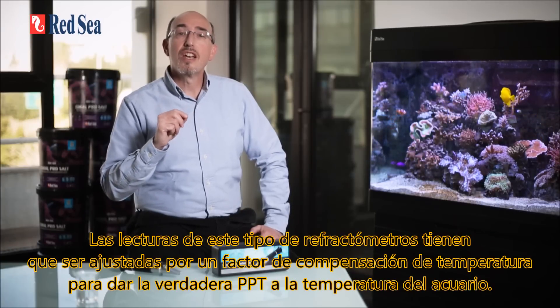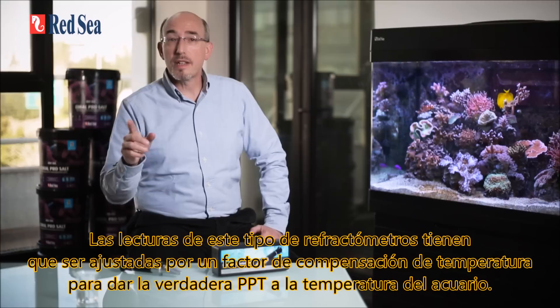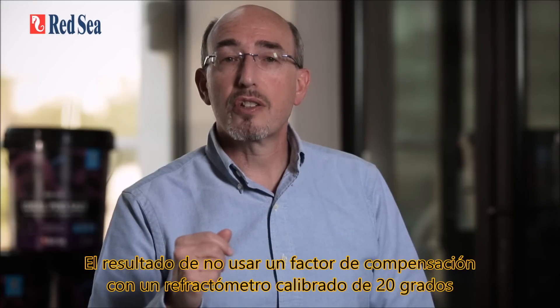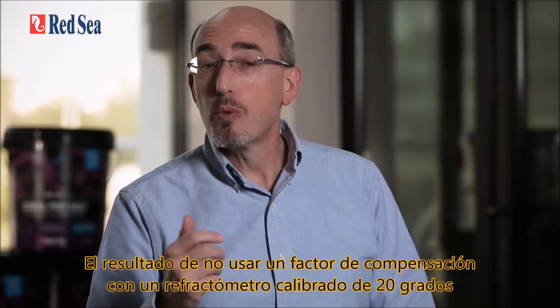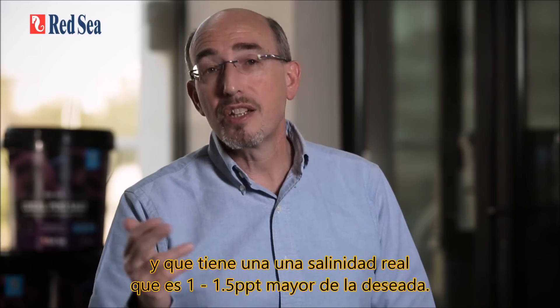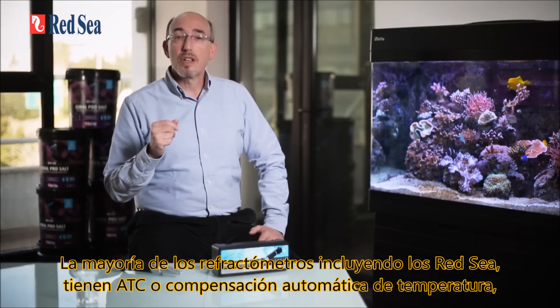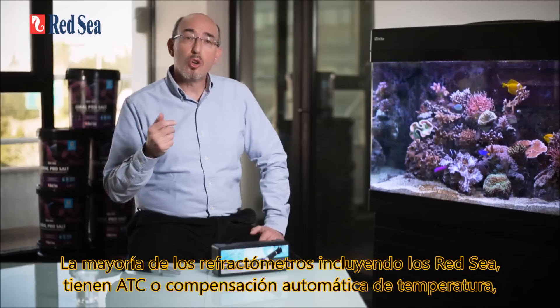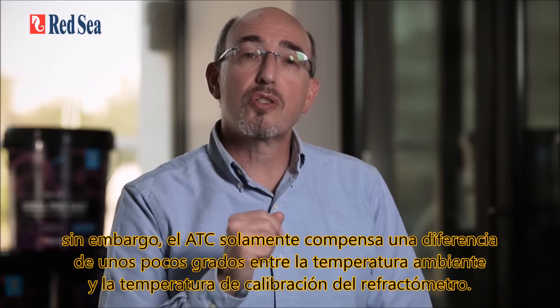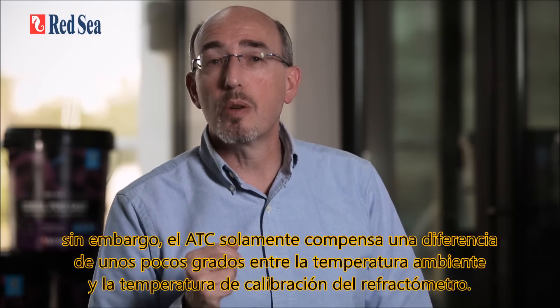Readings from such refractometers need to be adjusted by a temperature compensation factor to give the true ppt at the aquarium temperature. Not using a compensation factor with a 20-degree calibrated refractometer will result in using about 3% more salt than necessary and having an actual salinity 1 to 1.5 ppt more than desired. Most refractometers, including Red Sea's, have ATC or automatic temperature compensation. However, ATC only compensates for a discrepancy of a few degrees between the ambient temperature and the calibration temperature.